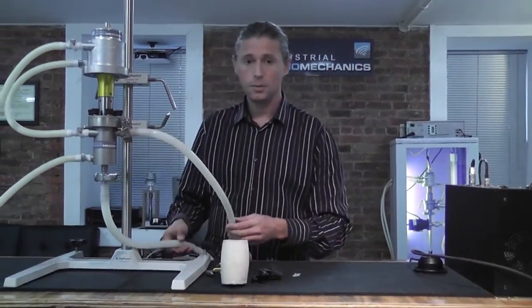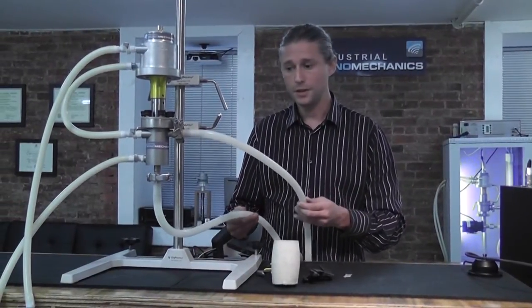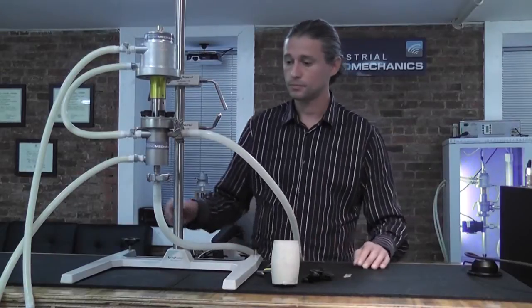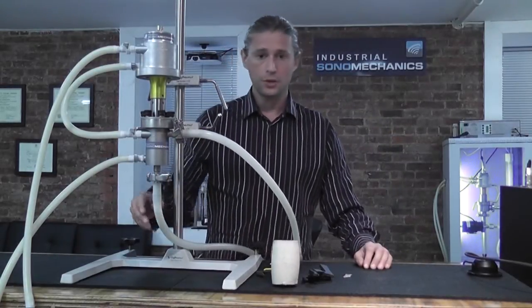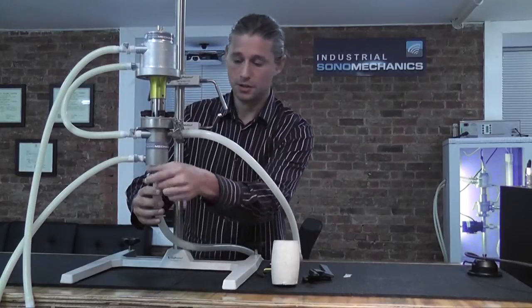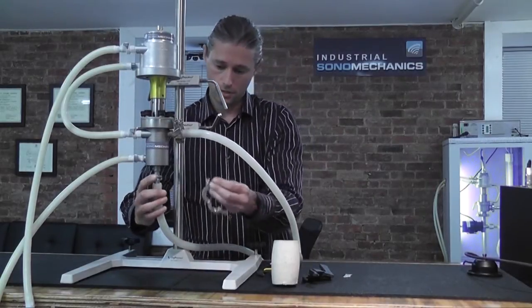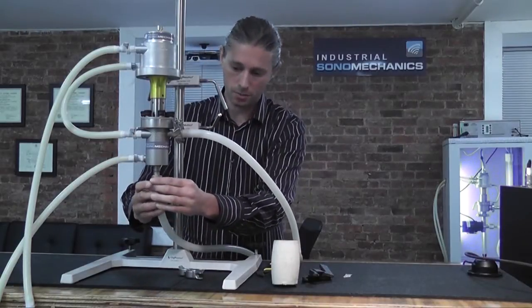Next, make sure there's no liquid in the main liquid lines. They need to be drained. When you make sure there's no liquid, you can disconnect these sanitary flanged half-inch connections. Sometimes they're also called tri-clamp connections.